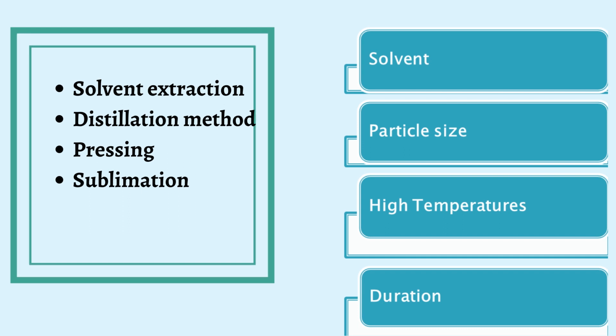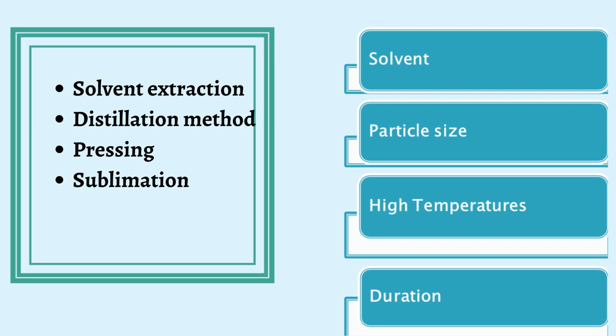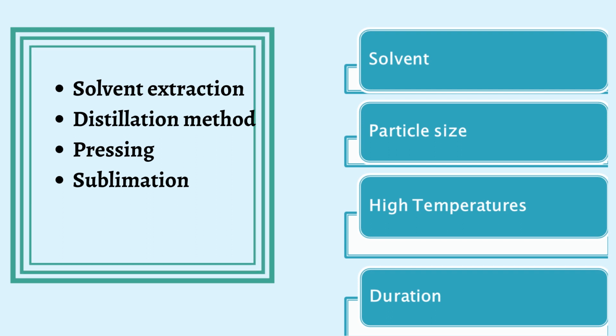The next parameter is duration. Extraction efficiency increases with increase in extraction duration in a certain time range. However, increasing time will not affect the extraction after the equilibrium of the solute is reached inside and outside the solid materials.